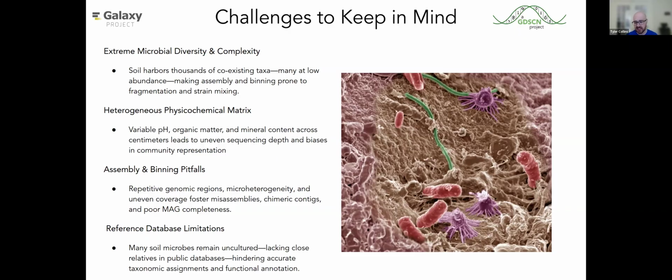Also, when we're doing taxonomic assignment, it is very dependent on the quality of the database for the tool we're using, on how much genetic knowledge they have, how many genomes they actually have stored in their database that we can compare against. And changing that can significantly change your results. These are just a couple of the things to consider. There are definitely more complexities, but this is just to point out that there will be a lot more problems that will arise, especially if you're doing this with your live data.